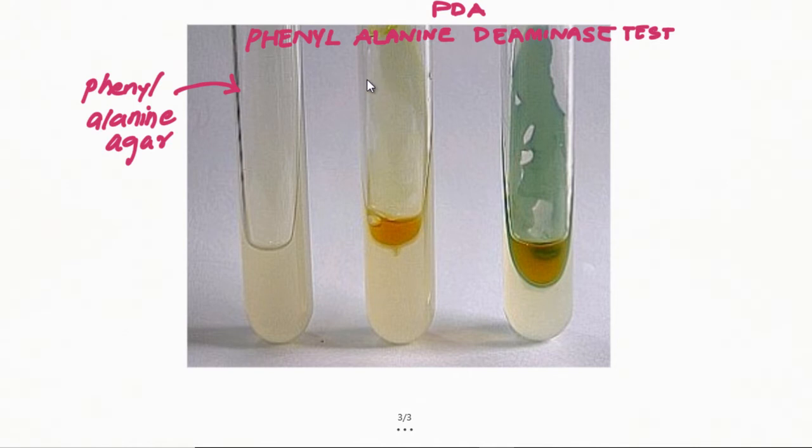It is totally white in color. Now what we do — we take our isolate and do the streak culture on it, then allow it to incubate. This is day one. On the next day there are two possibilities: either the reaction would be negative or the reaction would be positive.